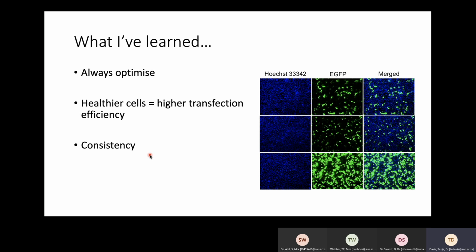I mean, there are so many different points of variation that can come into your experiment. So for you to be able to avoid variation from your transfection step will help a lot in the end with getting a successful experiment.